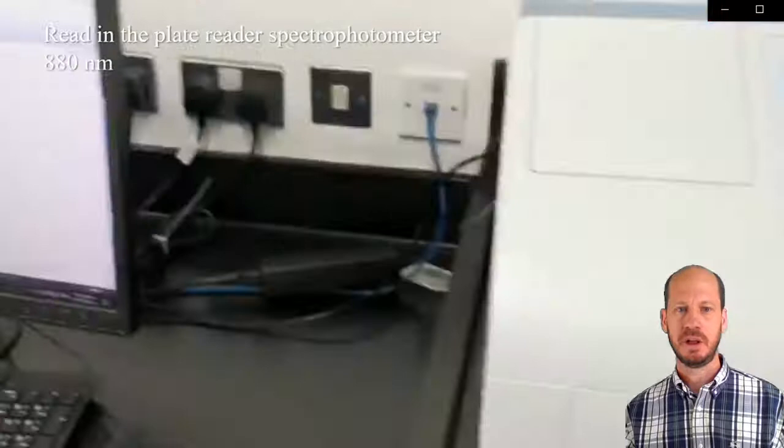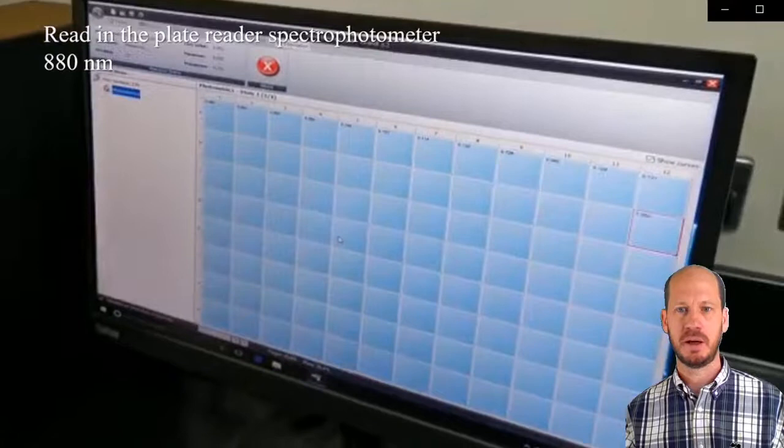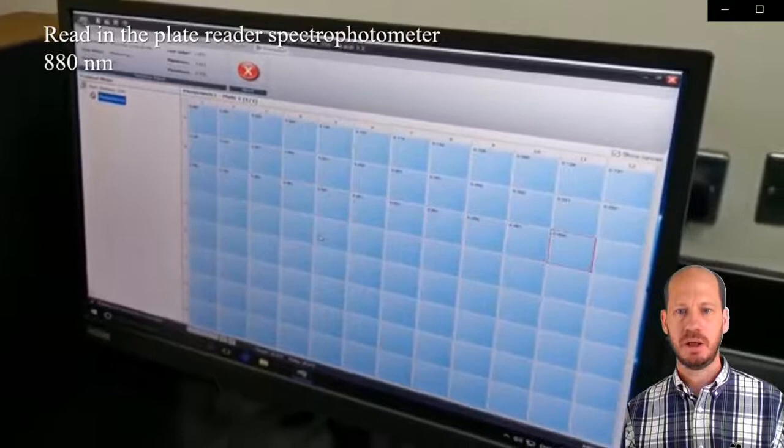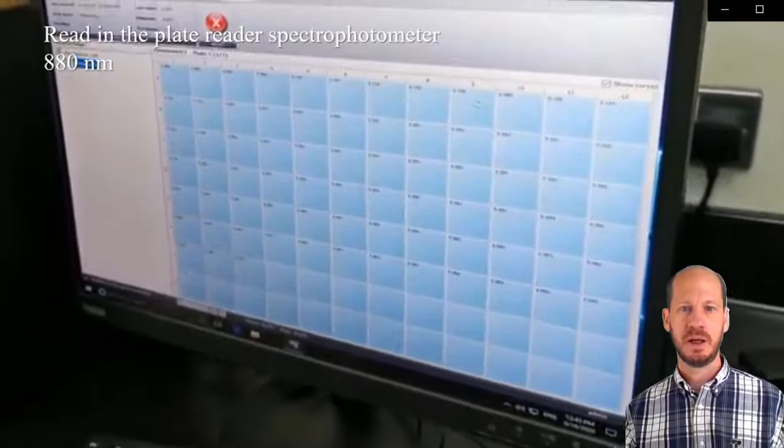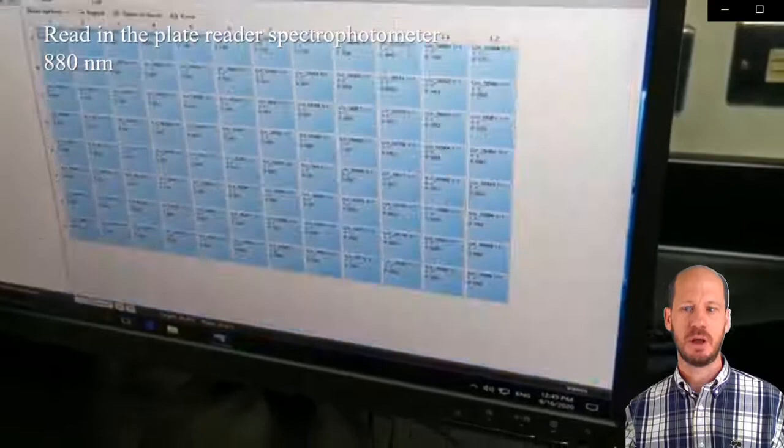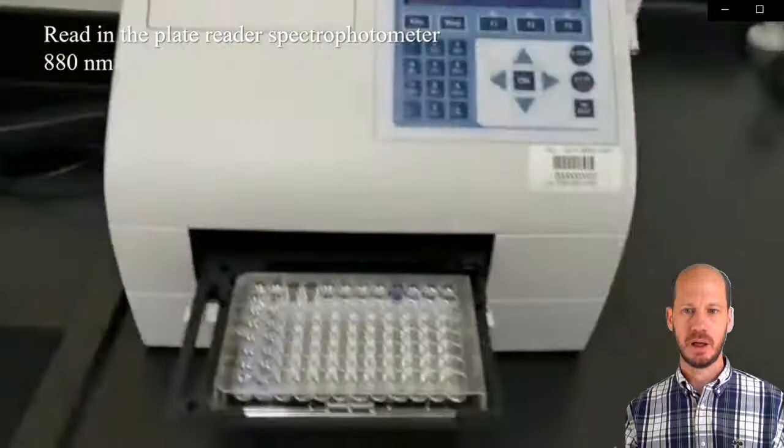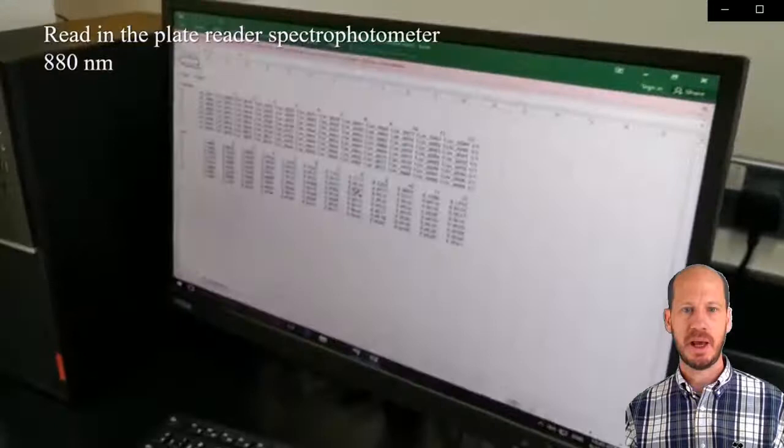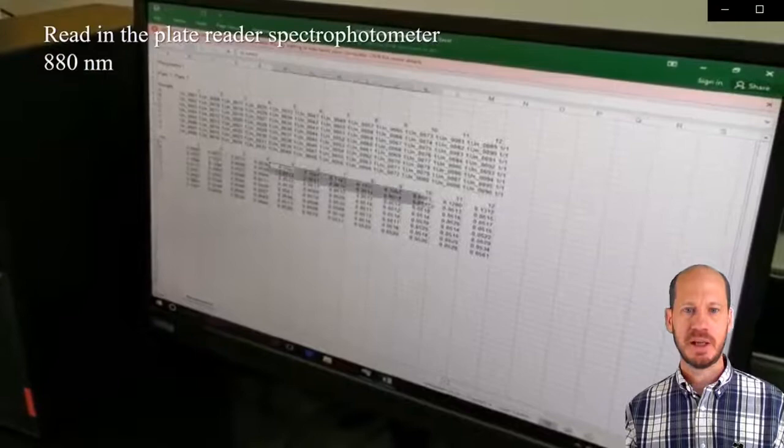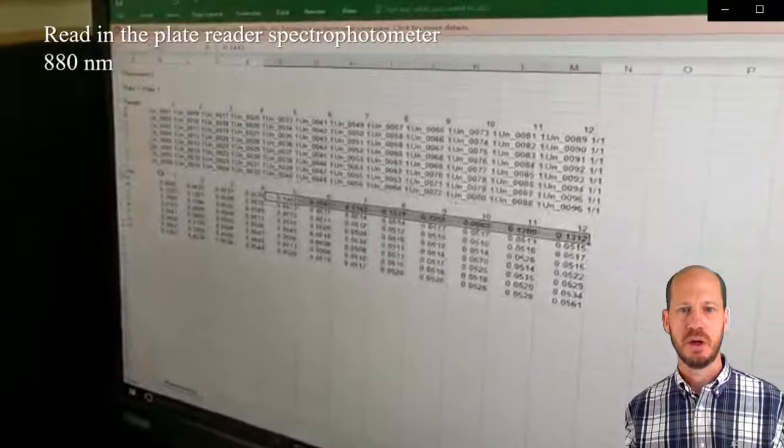When you press play, the machine will do the reading. The plate will go in and the readings will start. As the equipment starts reading, the data instantaneously appears on your screen. When the plate is finished reading, we have to open this data in Excel and work out the calculations. I prefer to do the calculations in Excel rather than in the software from the equipment.